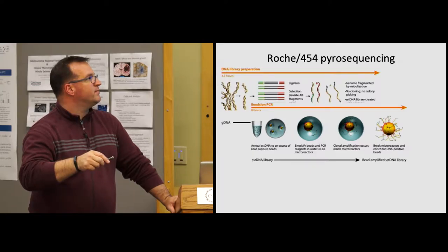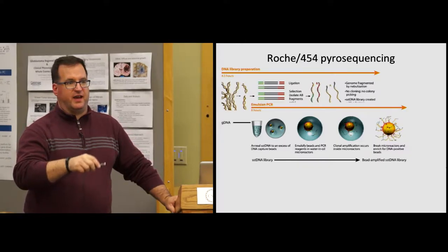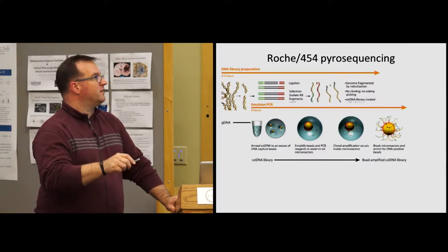And because it has both of these oligos on either end, one of those oligos is complementary to a probe that's on the bead, and so it anneals to the bead. Right? Then it also has the polymerase enzyme and the nucleotides in the emulsion such that when you now do regular PCR thermal cycling, you get many, many copies of that single clonal template made, and each of those copies can now stick to the bead. And so at the end of the day, you now have a bead that has hundreds of thousands of copies of the same original template DNA annealed to that bead. Does that make sense? Now, what can happen? What can go wrong with this picture?